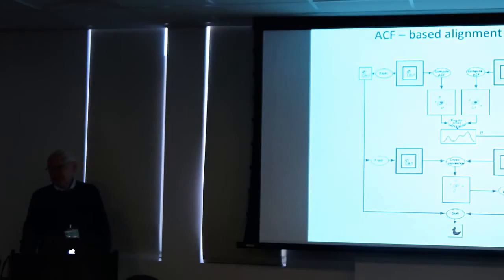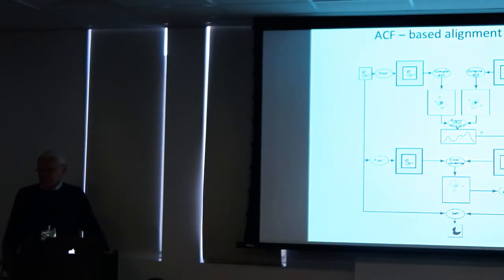Okay, and a question from the audience. I can ask one more question. So in terms of Richard Henderson, he's been really trying to bring the price point down by going after a 100 kV FEG. In your mind, is that the way to go, or is there another way to bring cryo-EM more to the masses and make it more accessible?